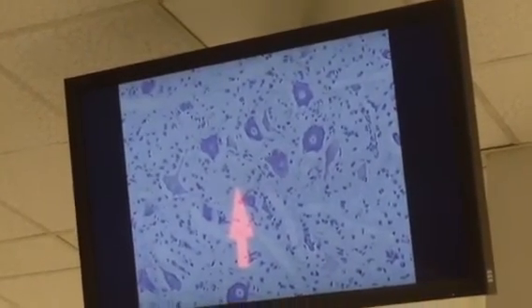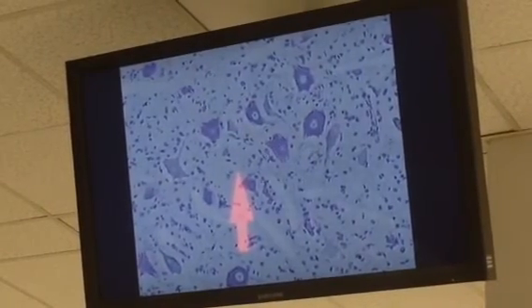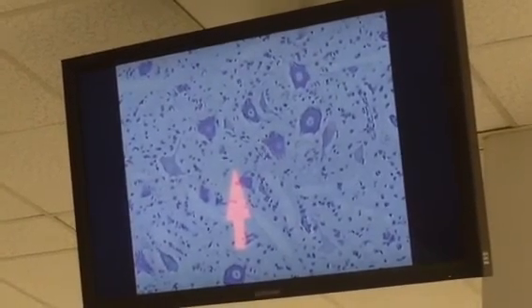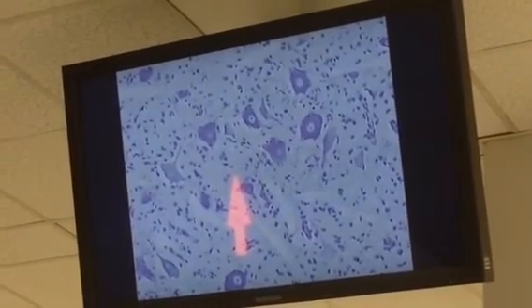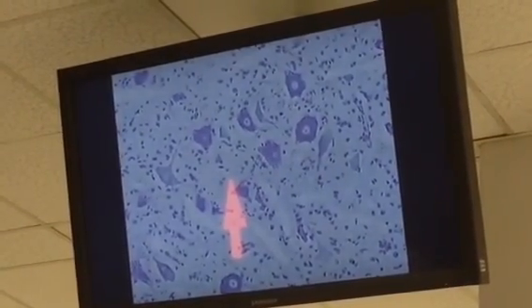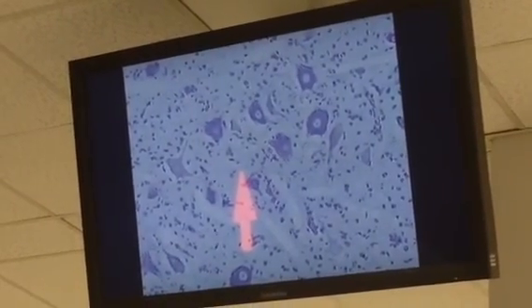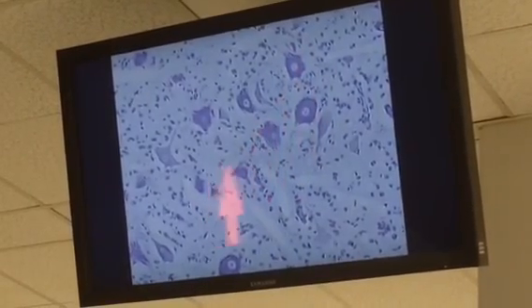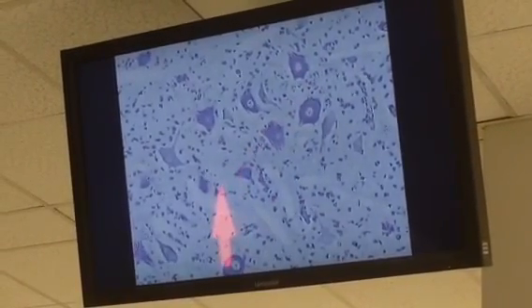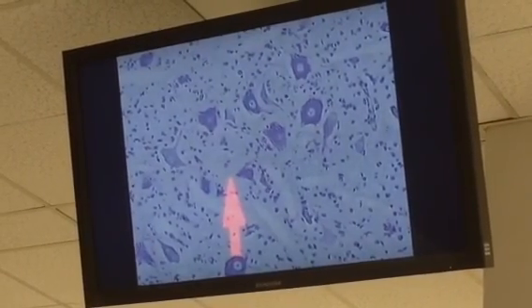Neuropil. So you have regions where cell bodies are densely packed, and when you're in the central nervous system, you call those nuclei. When you're in the peripheral nervous system, you call those ganglia. And in the central nervous system, we have some large neuronal cell bodies right here, but most of what we see is this lighter space, the neuropil. But that's really where the action is in terms of synapses and information processing.